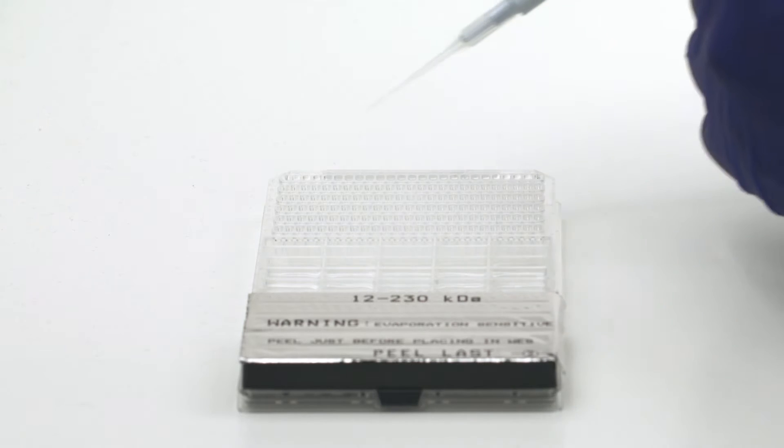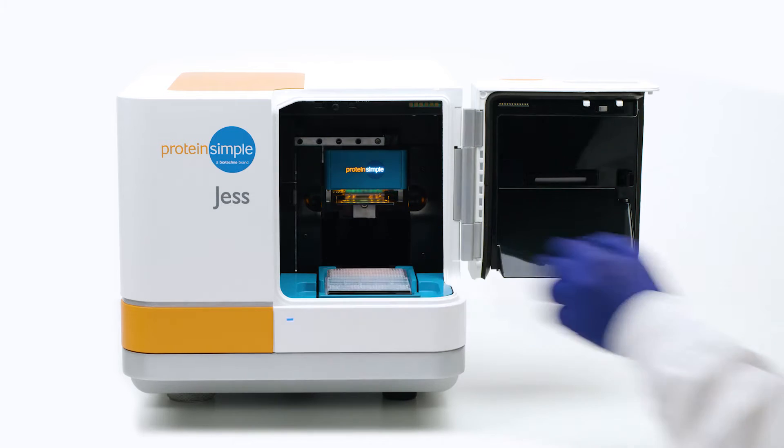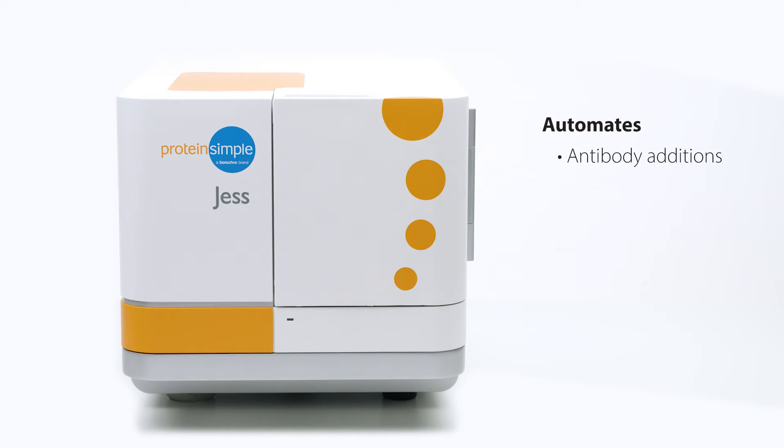Just load your samples and reagents into the microplate, insert the plate and capillary cartridge, and Jess does the rest. She separates your protein by size and precisely manages antibody additions, incubations, washes, and even the detection steps.